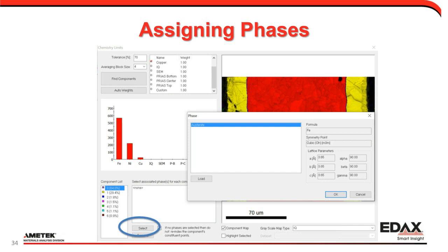But the question in the end is, is this value giving me enough separation between these phases that I can use these as a map? And sometimes you just don't have that. So yes, it can be done if you don't have the EDS data, but the question is whether these other maps differentiate between the phases strongly enough. So with that, are there any more questions?